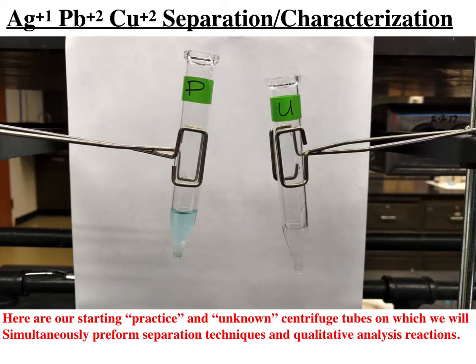Another thing I should have mentioned on the previous slide is the unique shape of these centrifuge tubes. They're not the typically shaped test tube that you may be a little more familiar with. These tubes are shaped in a particular fashion so that they fit properly in a device which we call a centrifuge. And we'll say a little bit more about the centrifuge when we carry out some of the procedures on subsequent slides.